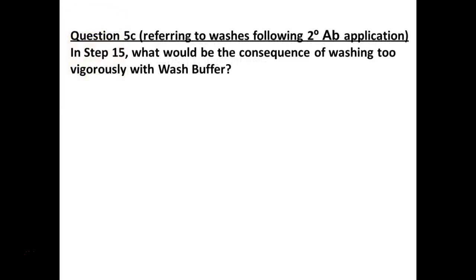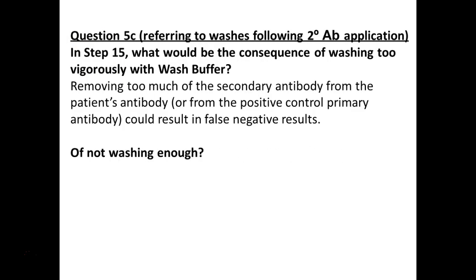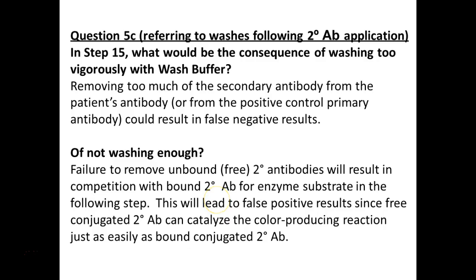3 times. Again, we don't want to wash too much, because we'll wash stuff out. But we've got to wash enough, and this is why we're washing 3 times, because especially for our positives, we've got a lot of stuff in there now. We've got antigen, primary antibody, and now secondary antibody. They can kind of get caught up in each other. We want to make sure to get them all out, so we're not soaking up.